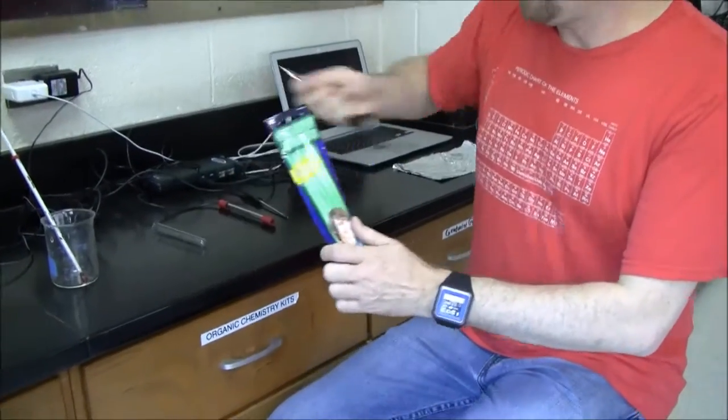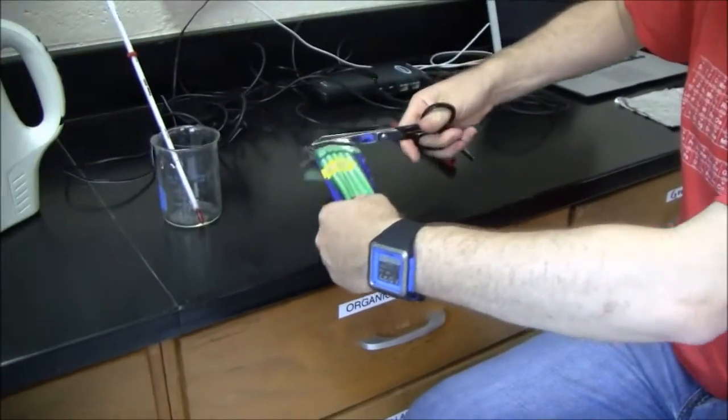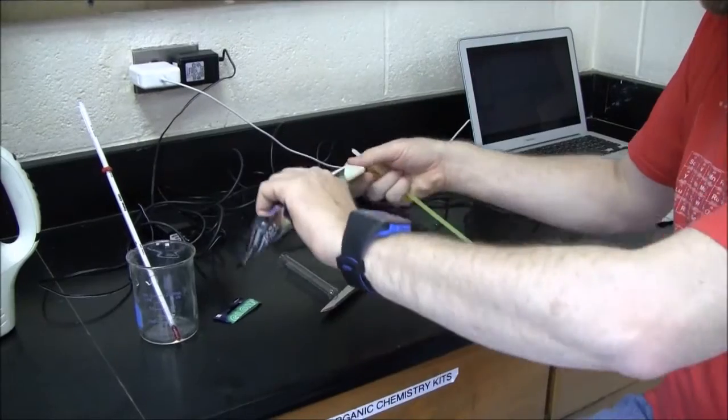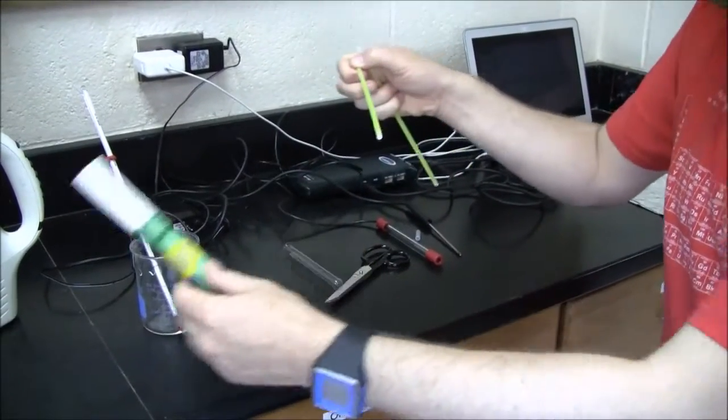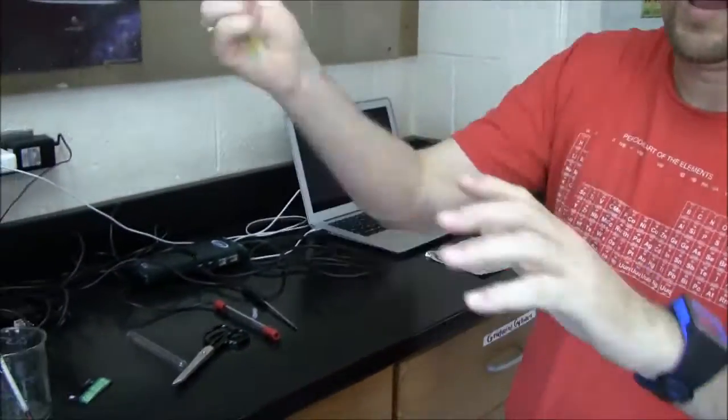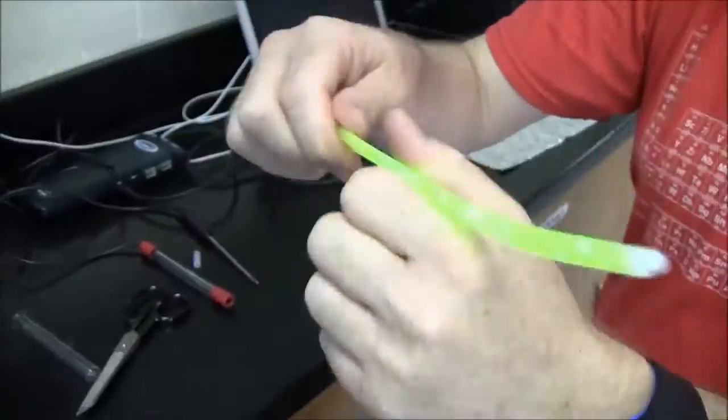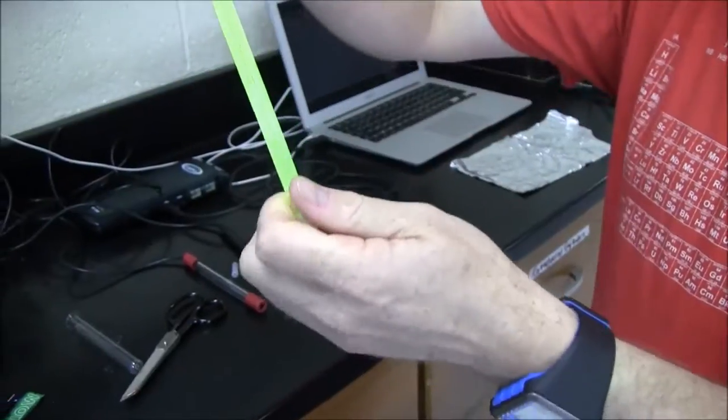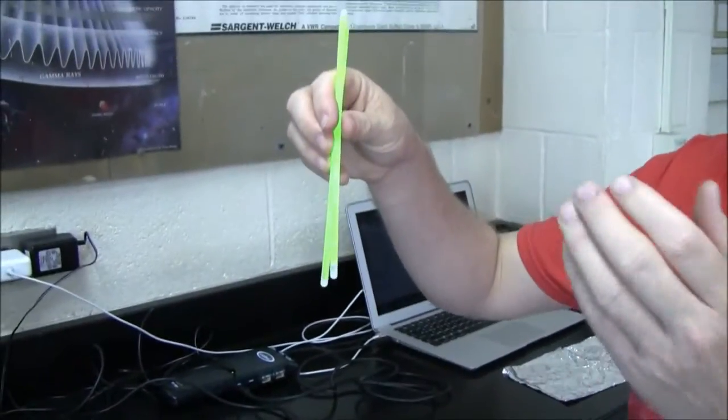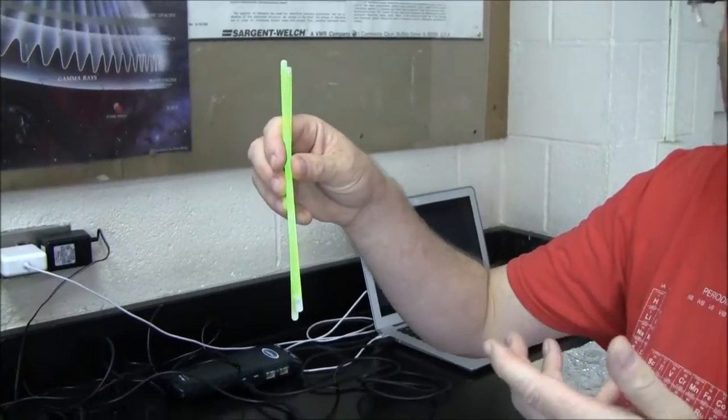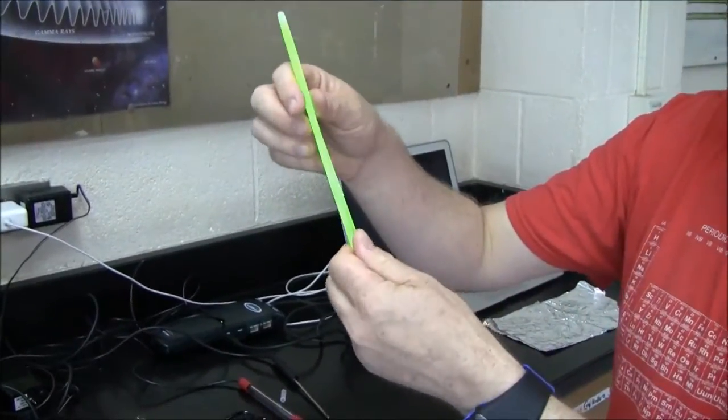Okay first of all open up the glow sticks. I'm probably going to need two to have enough fluid. There are two chemical reactions. We want the second one so the primary glow or the initial glow is going to take 10 minutes to fade then we're going to use the secondary glow.